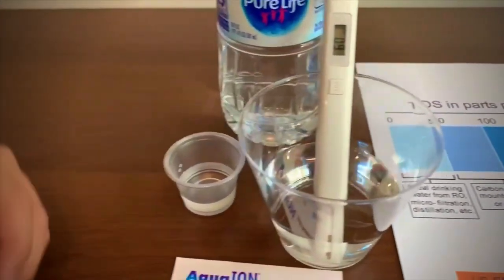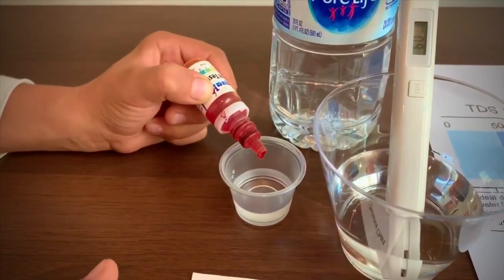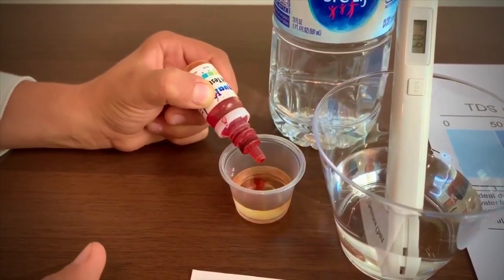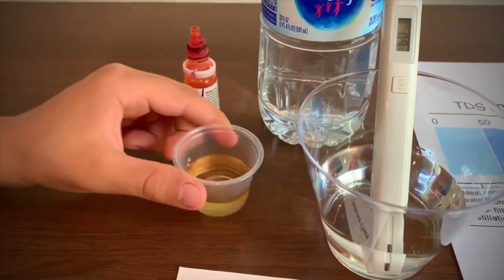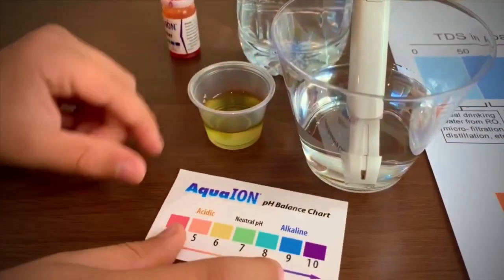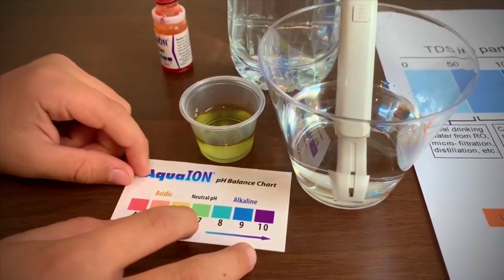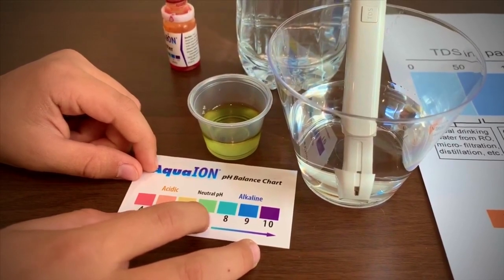Now let's test the pH. Only do two drops. This is 7 — that means it is neutral pH.